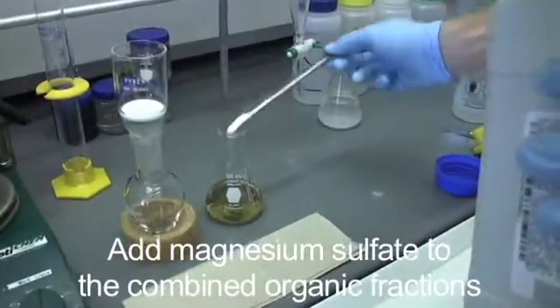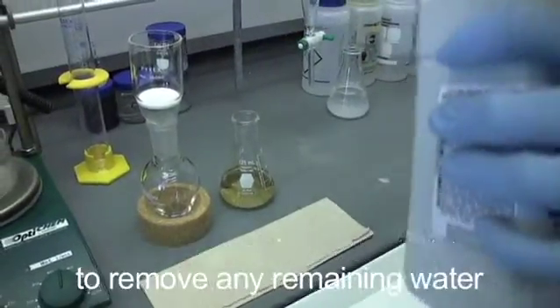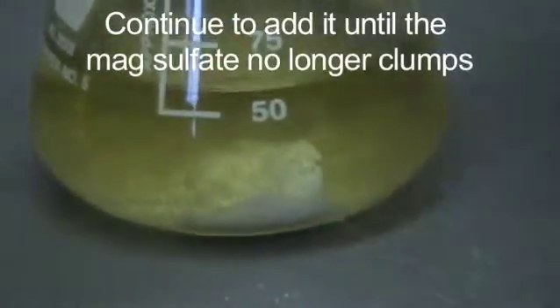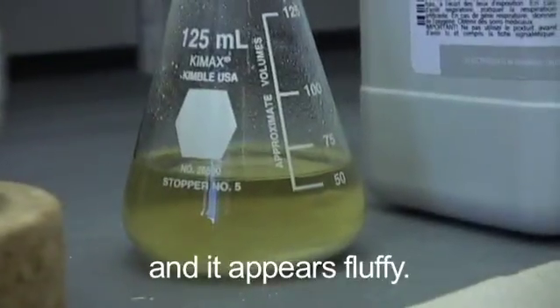Add magnesium sulfate to the combined organic fractions to remove any remaining water. Continue to add it until the mag sulfate no longer clumps and it appears fluffy.